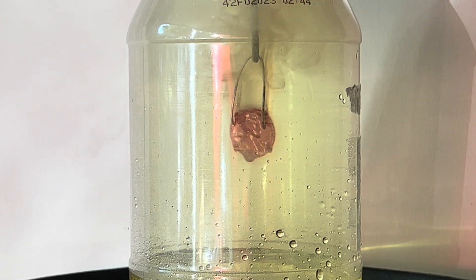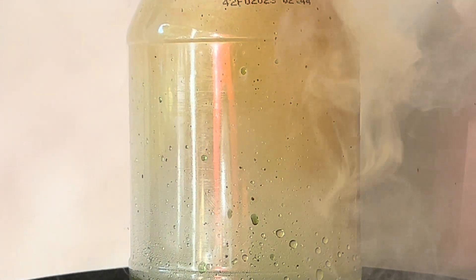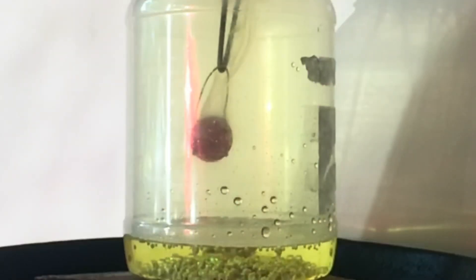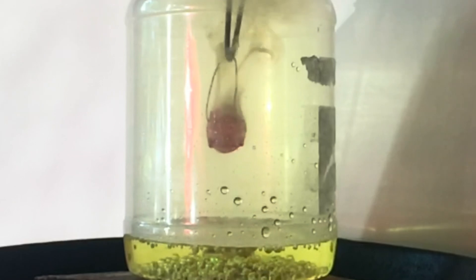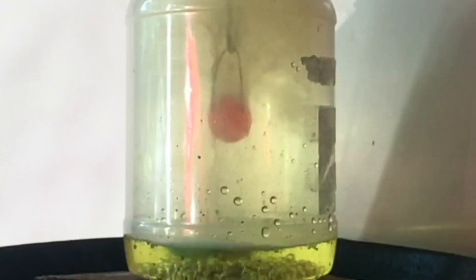When the penny goes in, the copper and chlorine react. Copper is dripping off as the jar fills up with noxious smoke. You can see the penny glowing from the heat.